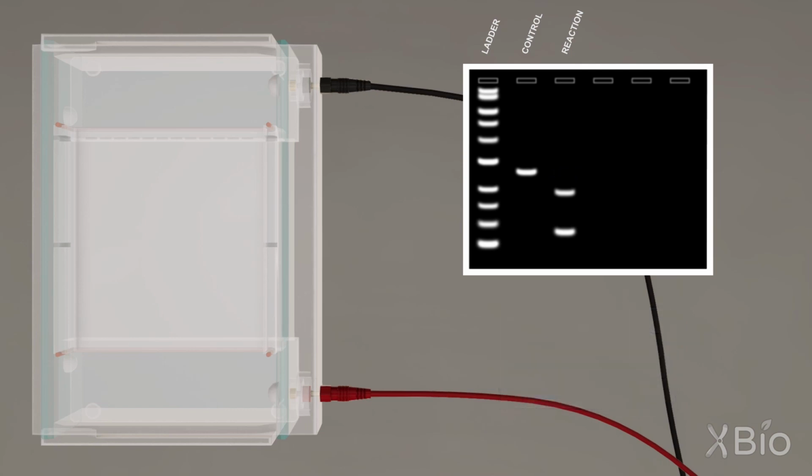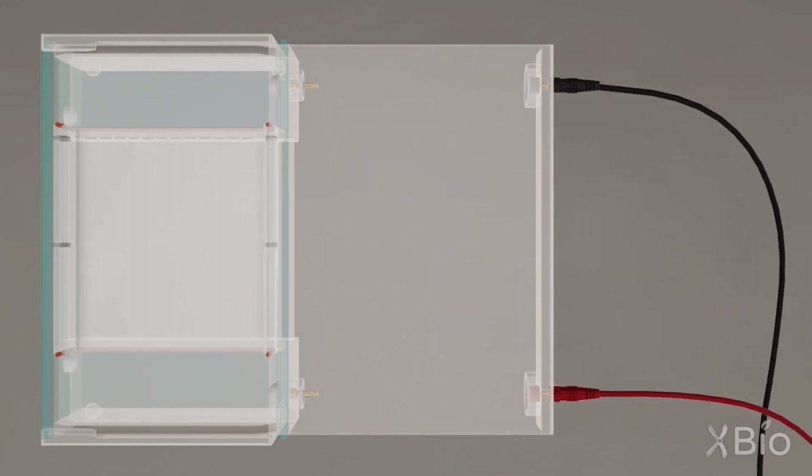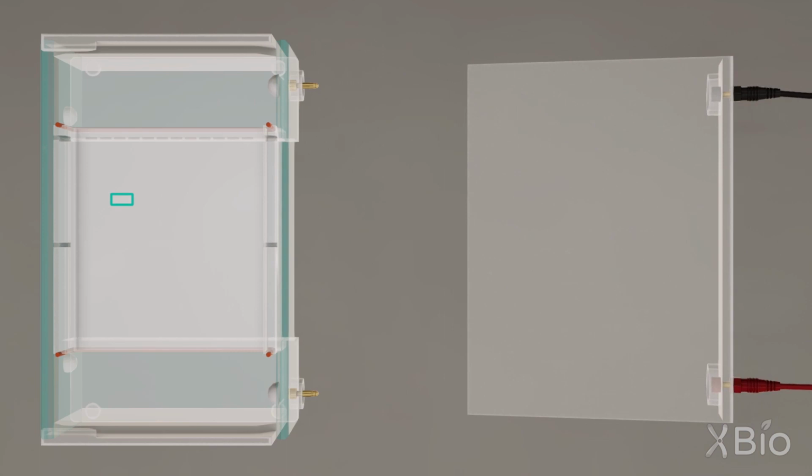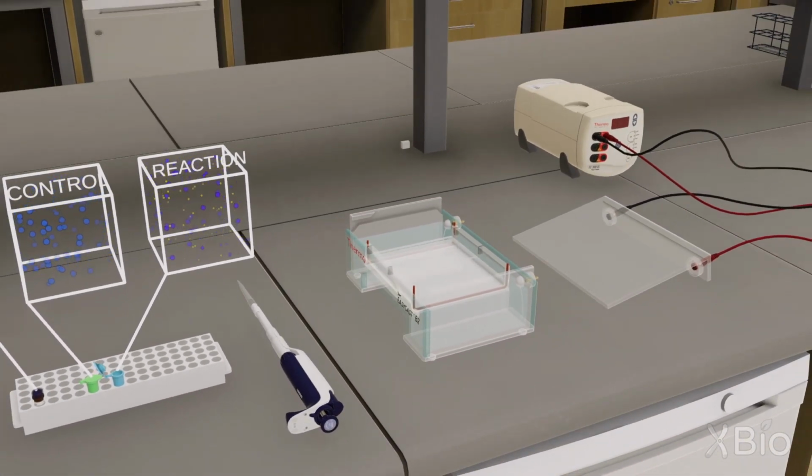All of this planning also made us better prepared to notice unexpected results, which can be the harbingers of new discoveries. More commonly, we'll simply move forward with our research using the information we gained from the gel. If we need to isolate specific molecules for further analysis, we can do that as well. Even though we just scratched the surface in this segment, hopefully you now appreciate why gels are such a powerful and integral part of molecular biology research.